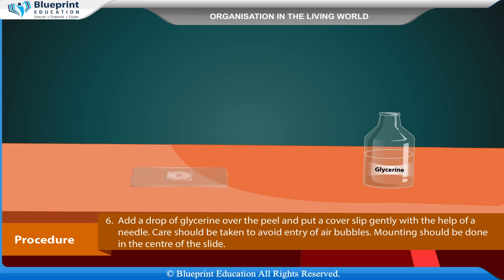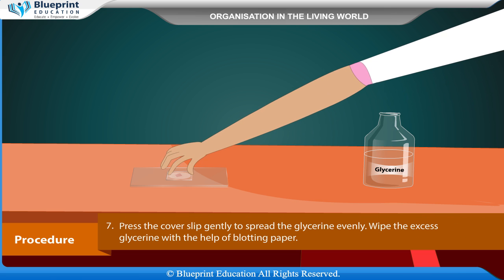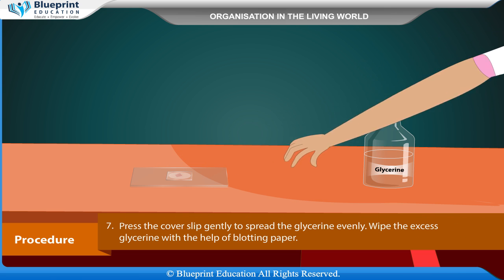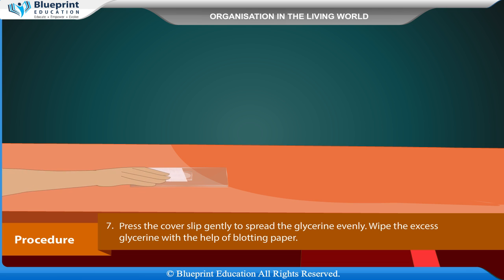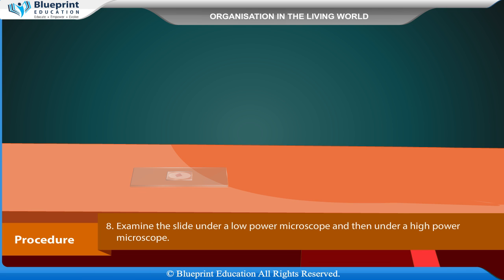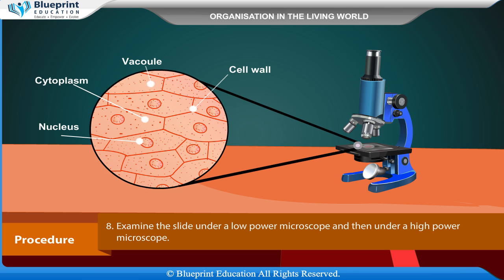Mounting should be done in the center of the slide. Press the cover slip gently to spread the glycerine evenly. Wipe the excess glycerine with blotting paper. Examine the slide under a low power microscope and then under a high power microscope.